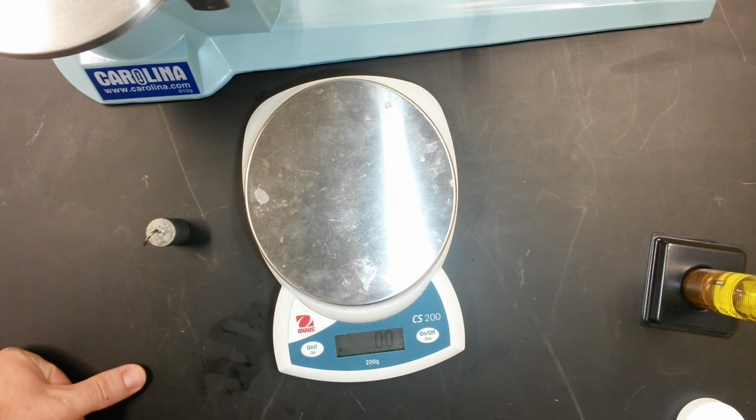All right, once you have made your measurements, make sure you record them on your data table, and we'll get a better understanding of the difference between mass and volume.